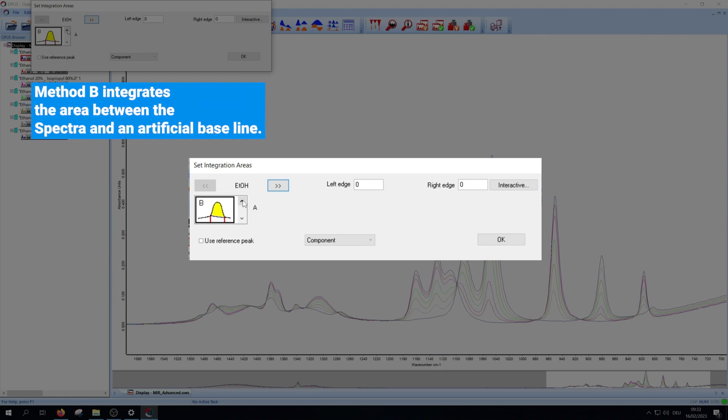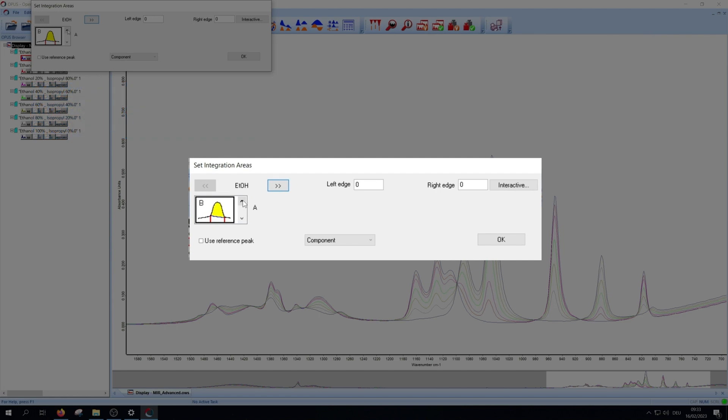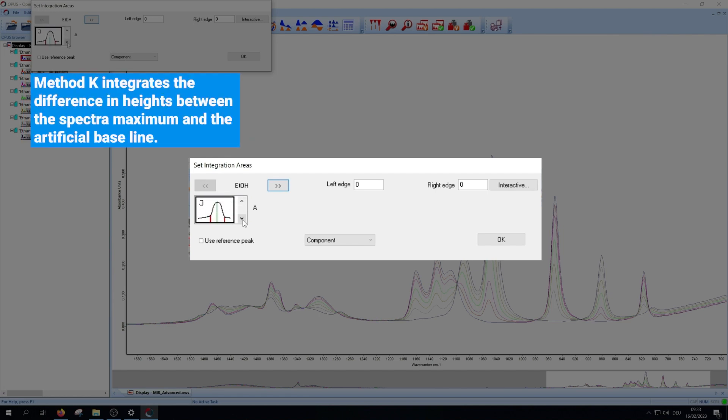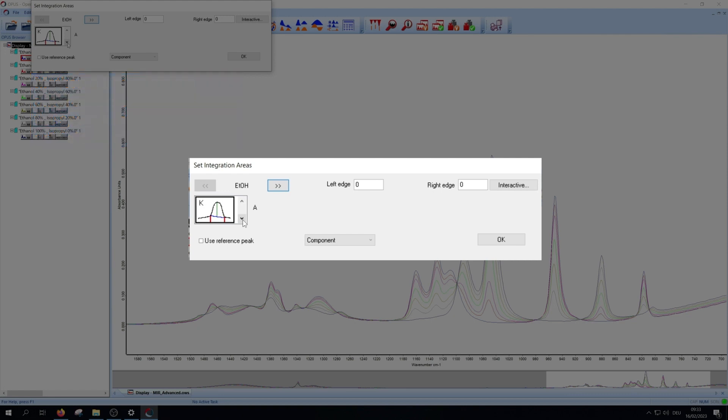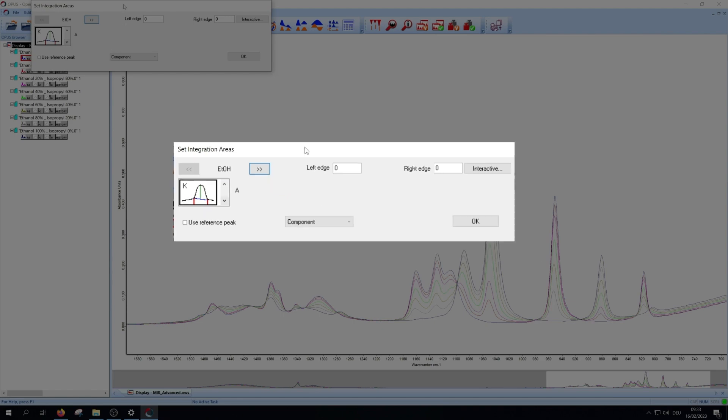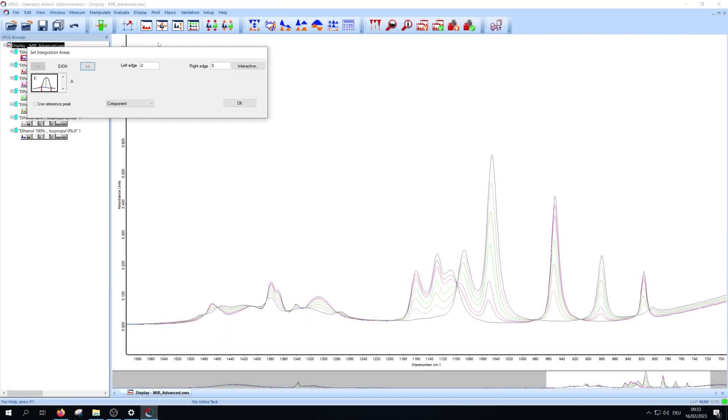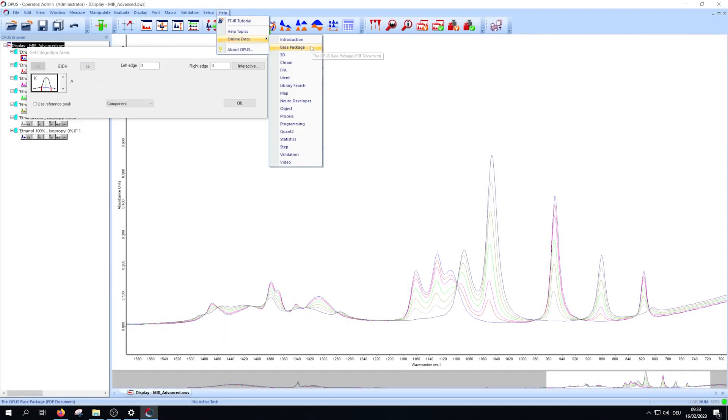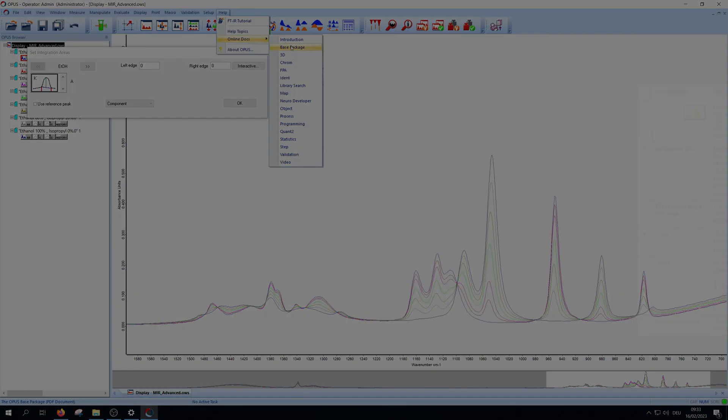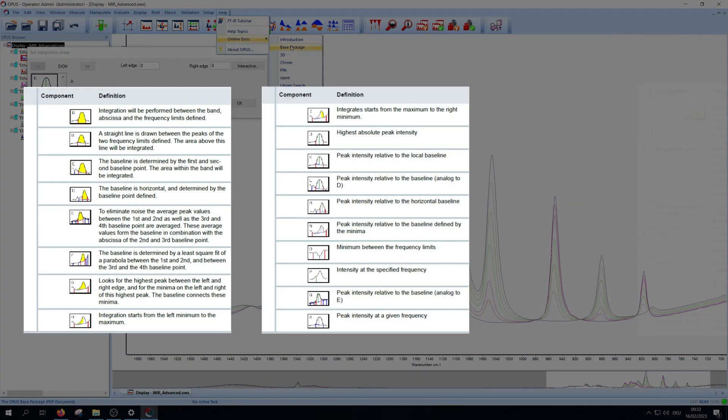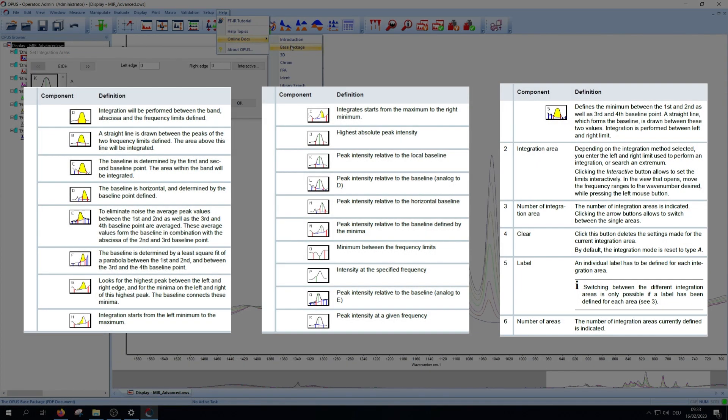Method B integrates the area between the spectra and an artificial baseline. Method K integrates the difference in height between the spectra maximum and the artificial baseline. For more information about the different integration methods look at help, online docs, base package, in the chapters 9.2 for integration and 9.3 for setting up quant method.